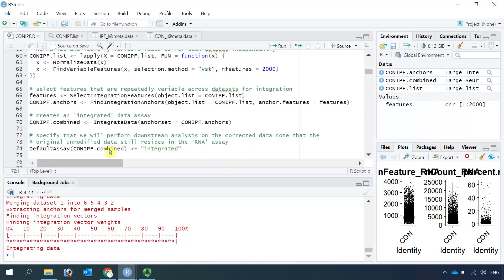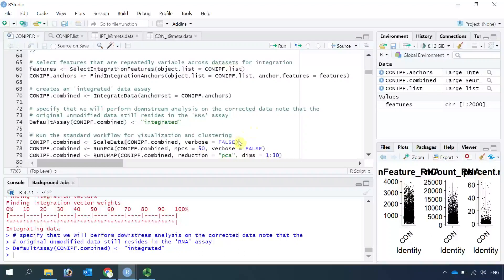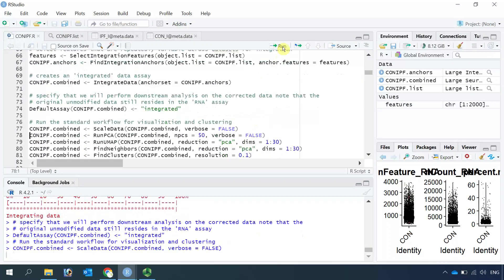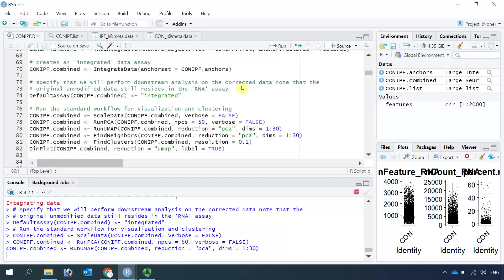Now we need to set the integrated data as the active assay to specify that we will perform downstream analysis on the integrated dataset. After that we can perform the standard workflow for visualization and cell clustering: scale the data, run PCA, then run UMAP, then find neighbors and clusters.